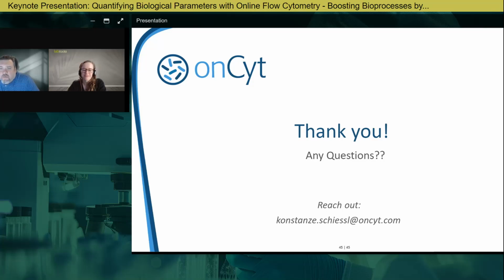Got time for one more. Go with, can you quantify smaller biological particles like a virus? Yeah, virus indeed is too small. It's a bit like I said before, that there is a lower size range, and it's just the physics of the optics. You come into a size range where the laser light has the same size as the particle, and then it just cannot be quantified anymore. So unfortunately, a virus cannot be measured with a flow cytometer.